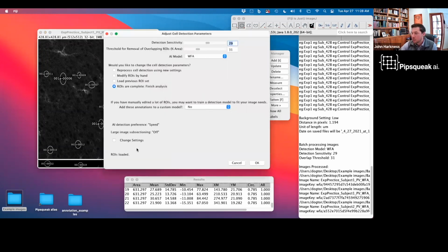But that's exactly how that works. One of the things that is upcoming, and I've already had someone ask for, is: can we do this for co-localization or for multi-label analysis? Can we do batch processing for multi-label? The short answer is not yet, but the way you can do it currently is to analyze each of those channels, maybe in a separate batch workflow.